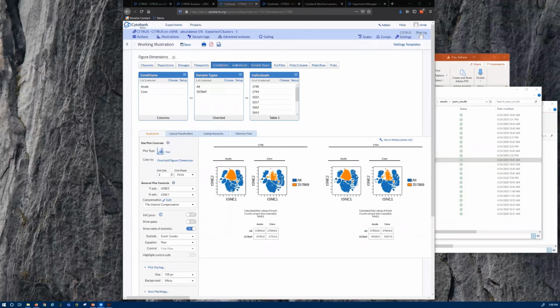Actually, there is not, but with an increasing number of events, the algorithm will become more likely to fail. I think that's really a combination of events and channels, so I don't have a black and white answer for that. But if Chihao or Chen-Jun have a more specific answer, please step in. Oh, that's perfect. That's exactly how it works in Cytobank. You can always try to see what's the next number you can input.